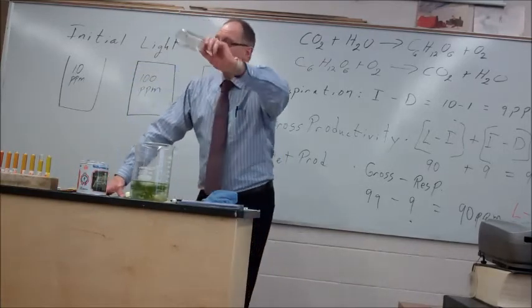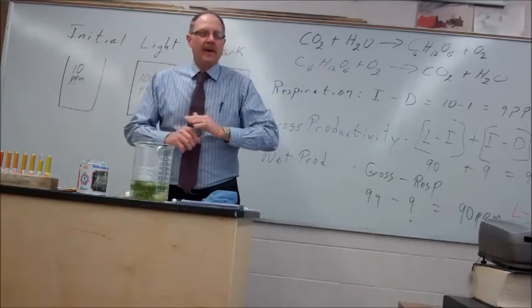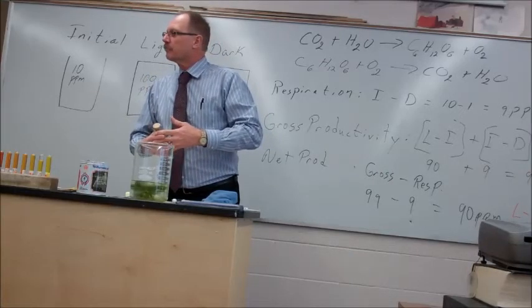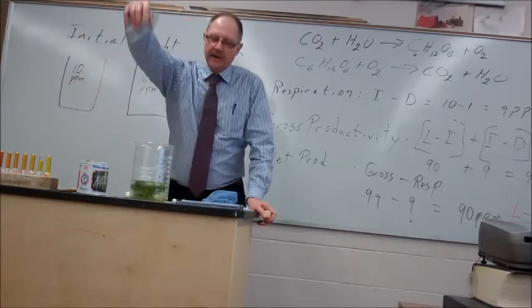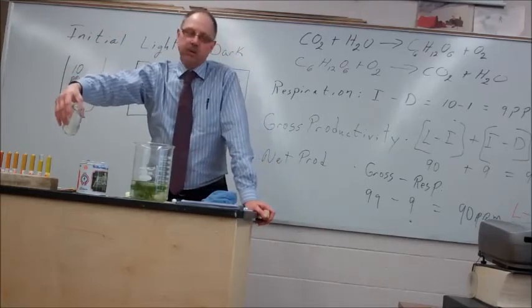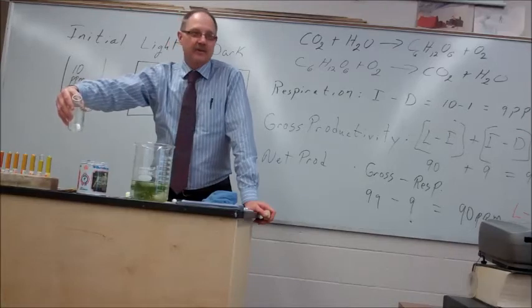There are some things you have to watch out for, though. First of all, what's the main way that oxygen gets introduced into water? We talked about it yesterday. Turbulence. So if you take this bottle and just hold it in the aquarium, and go blub, blub, blub, blub, blub, you're going to be adding an awful lot of oxygen to it, aren't you?